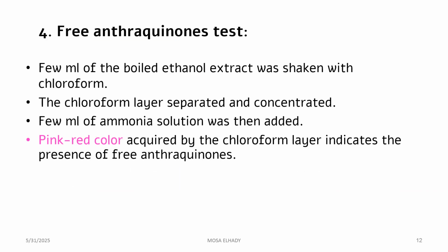The fourth test in this lecture is the test for free anthraquinone. That means anthraquinones are free from the sugar moiety, and we expect they are hydrophobic or soluble in semi-polar solvents such as chloroform, ethyl acetate and ether, but they are insoluble in water.